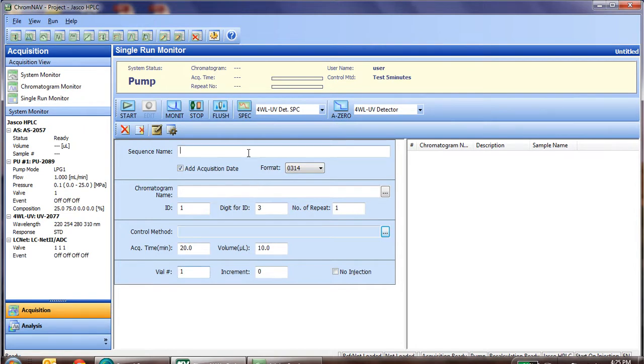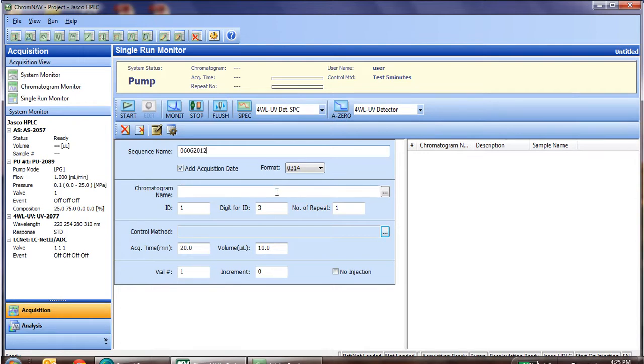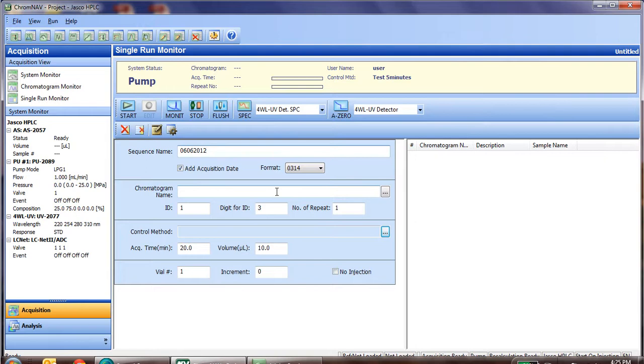The first step is to enter in a sequence name. A sequence name, typically, is just the date. However, if you're going to run this sequence again and again, you can specify the name of that so you can open at a later time and rerun the sequence. Again, we're currently just running single runs, so the date is a very common entry.